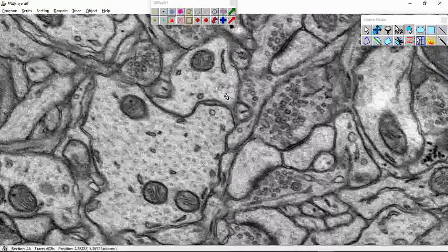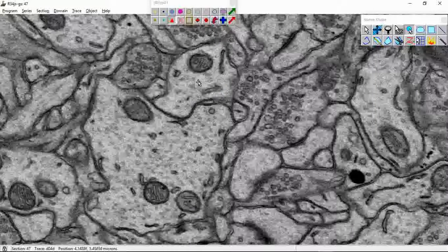And at this point, the origin is probably gone. I could stamp it and then look at the 3D later and then decide whether to keep that protrusion stamp. I'll just go ahead and put it down for now. And the reason that I like this approach is because not only do I get a general sense of what the dendrite is like and where its protrusions are, but you also get to look at the dendrite without being focused on the plasma membrane.